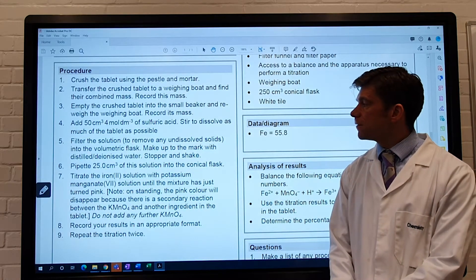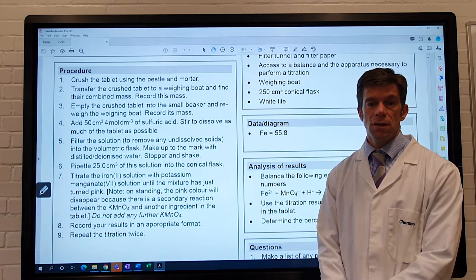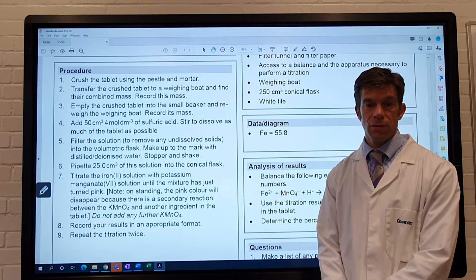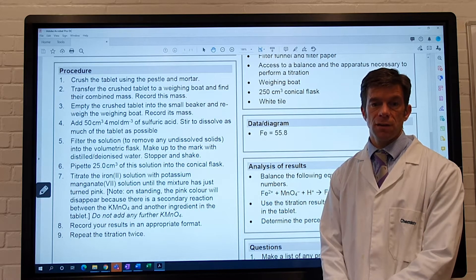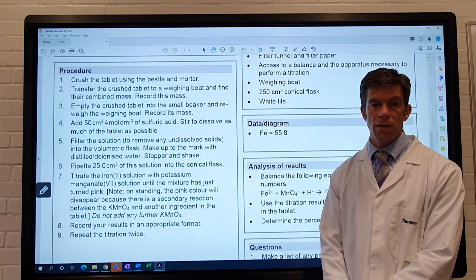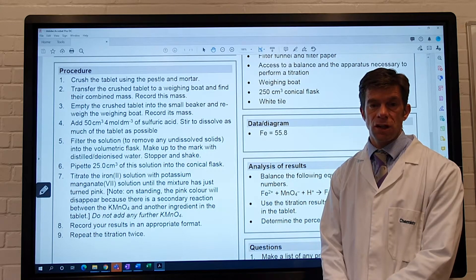Step 5, filter the solution to remove any undissolved solids into a volumetric flask, make up to the mark with distilled water, stopper and shake.